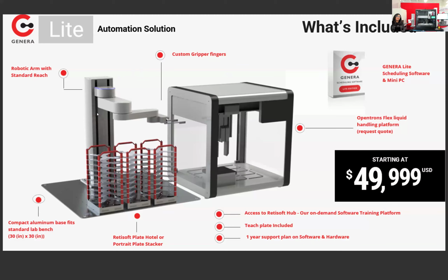It is embedded within the license. So this is a nice solution for any benchtop applications that have limited hardware. You could have the Opentrons on one side, and you could have a reader or flow cytometer, any data analysis or storage if you want to increase the capability or throughput of the Opentrons and the stackers by themselves.